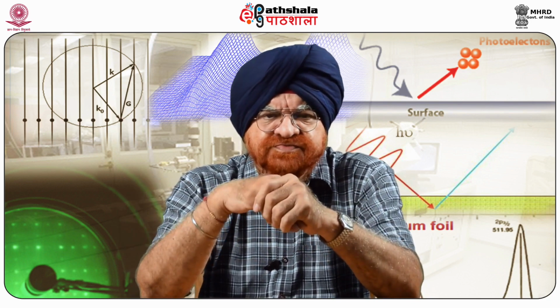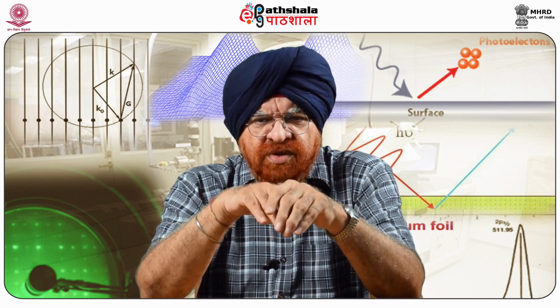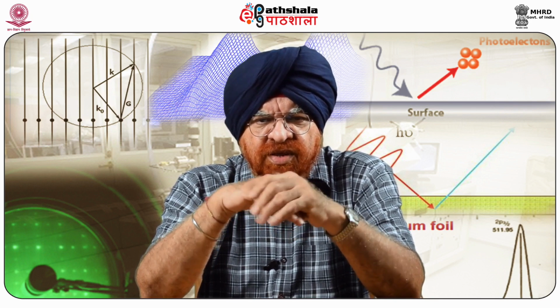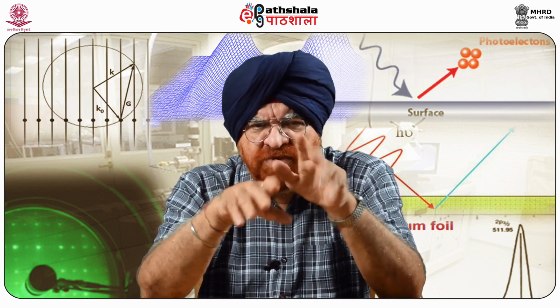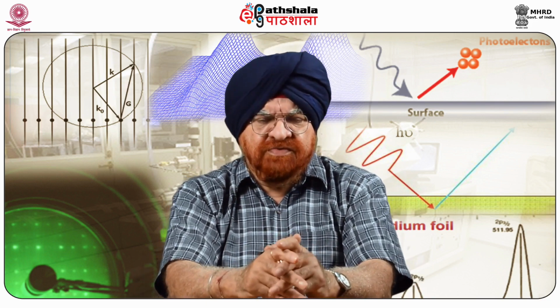If the measurements are conducted in ambient air or liquids, the thermal noise is especially important because sometimes if it is not controlled, it interferes with the proper measurement.